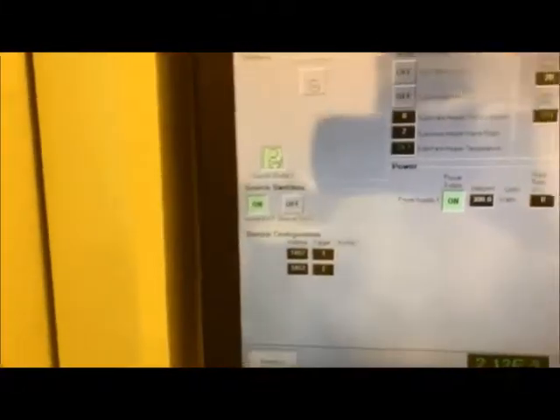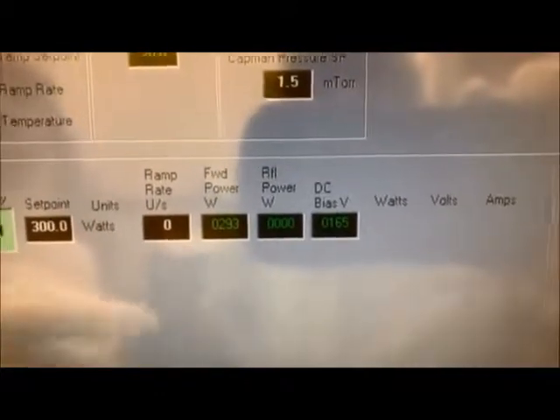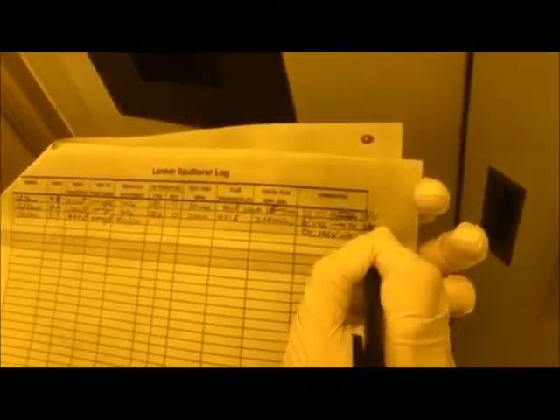So after opening the shutter, you can see the plasma go up, and you can also see the DC bias is going to increase a lot as well. So it's changing from 126 to 165. You want to write that down in your log sheet as well. So it's now changed from 126 to 165 volt. And we will come back in 24 minutes.